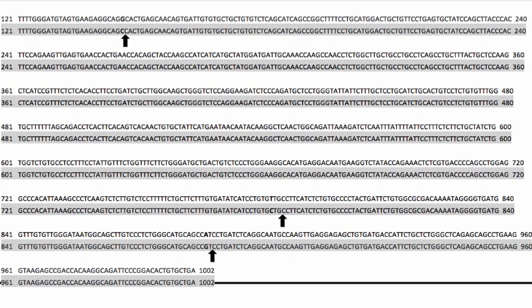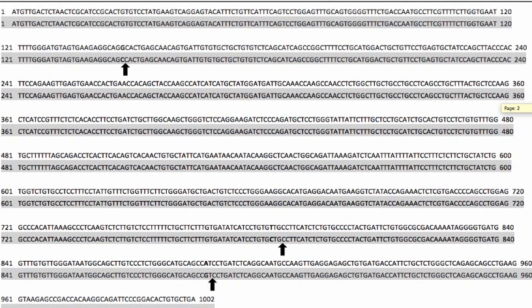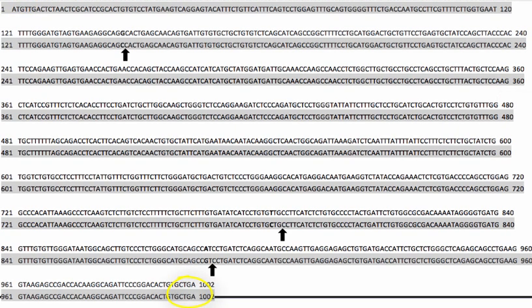You might also note that this read of our gene starts with ATG. This would be the AUG start codon for methionine. And it also ends with TGA, which makes the stop codon of UGA. This side-by-side comparison of the two genes has been edited to contain only the translated part of the gene. No introns either. They have been edited out. The sequences you're looking at are pure translatable codons.